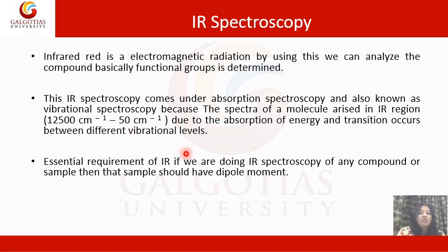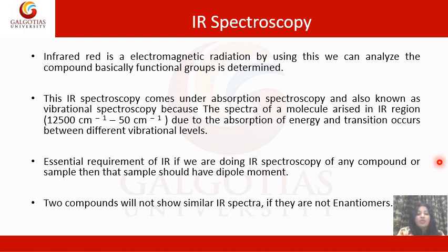Essential requirement of IR: if we are doing IR spectroscopy of any compound or sample, then the sample should have a dipole moment. Two compounds will not show similar IR spectra if they are not enantiomers.